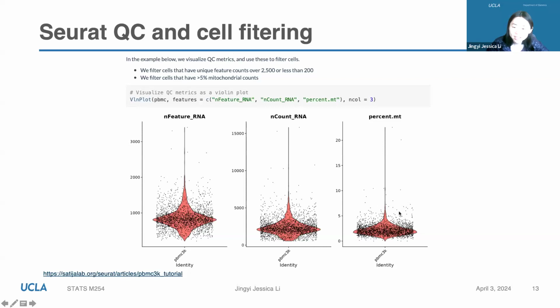But back to the question asked in the chat box by Daniel, you will see that there's no such clear-cut threshold. I don't know what you see from your eyes, but based on my eyes, I don't think there's a very clear-cut threshold. So you see a gap between the things you want to filter out and the things you want to keep. The change seems to be rather continuous.